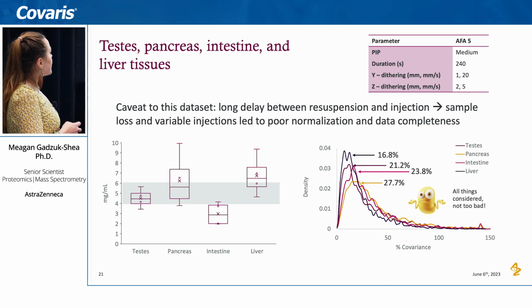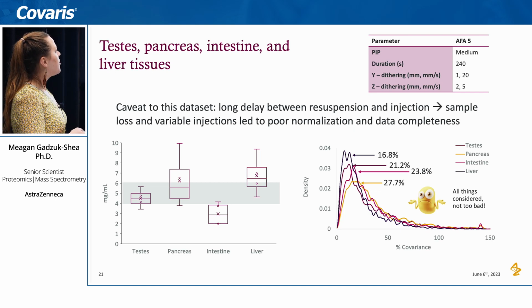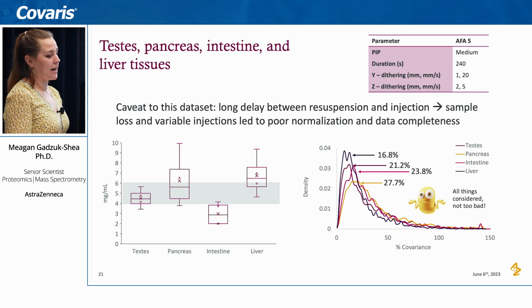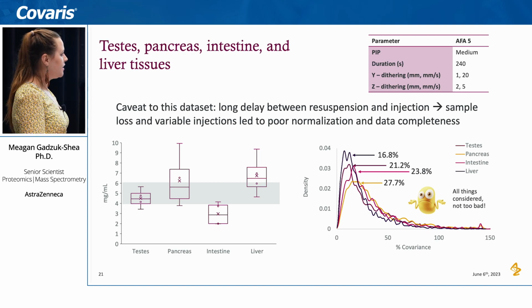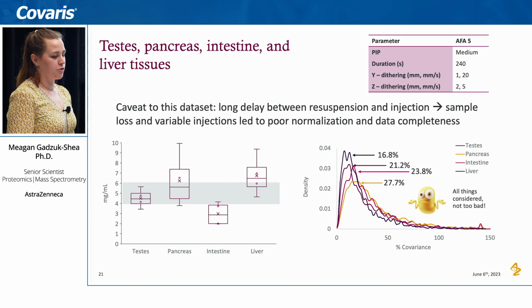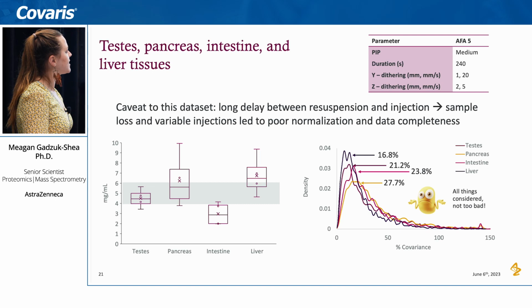However, what we can see is that the protein extraction, which isn't going to suffer from this issue, we are still getting really great extraction levels. And then even in the mass spec data, all things considered, the CVs were still pretty close to that 20% benchmark that we wanted to see. So, this work is moving in the positive direction, but it's still not perfect.